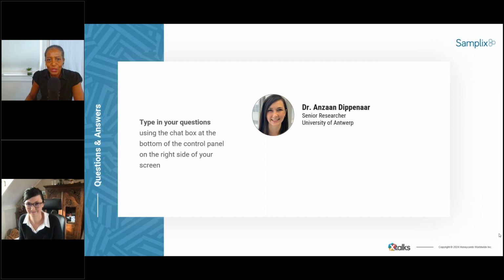The next question we have for you is, do you grow the Mycobacterium in the droplets and then lyse it in the droplets? Right. Interesting question. That is something that we've definitely considered, but we haven't done in this pilot study.